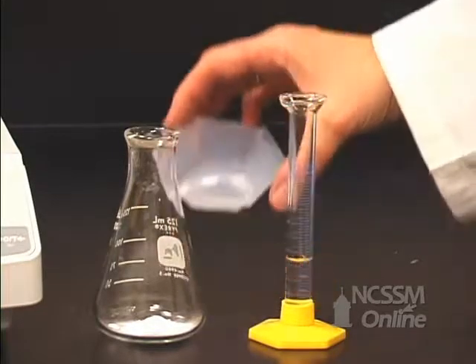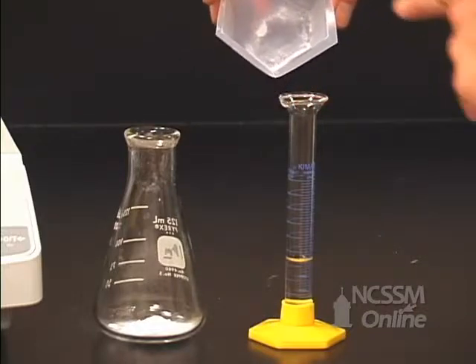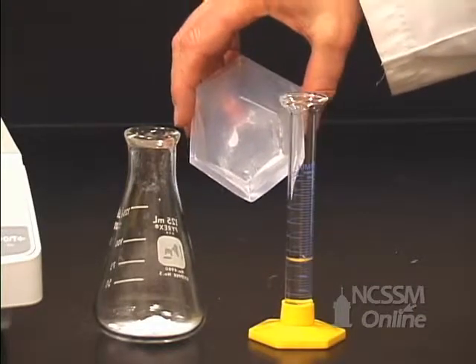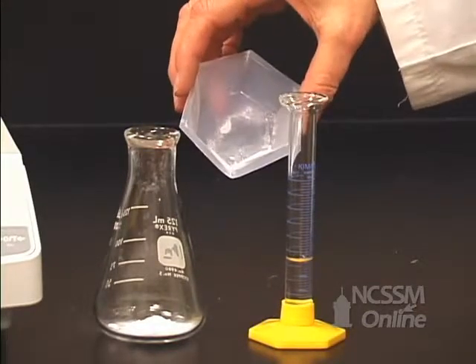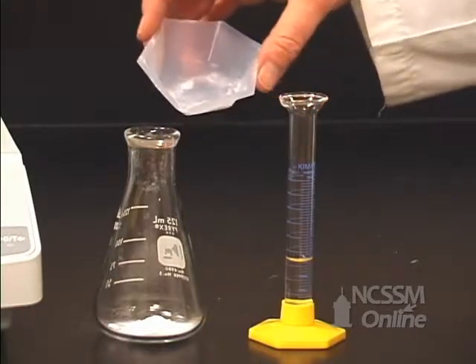Now we want to add between 4 and 5 milliliters of the liquid acetic anhydride. As you can see, there's a little of our salicylic acid in our weighboat.